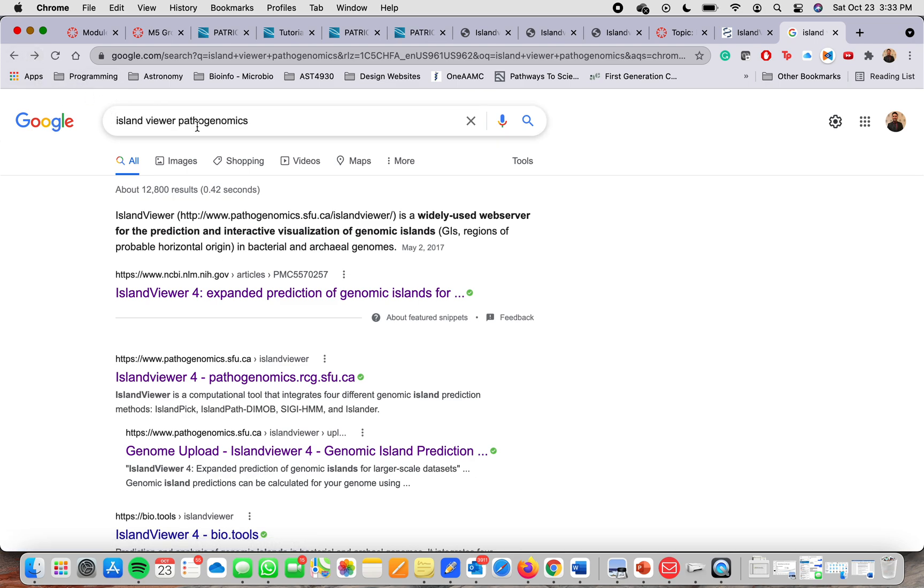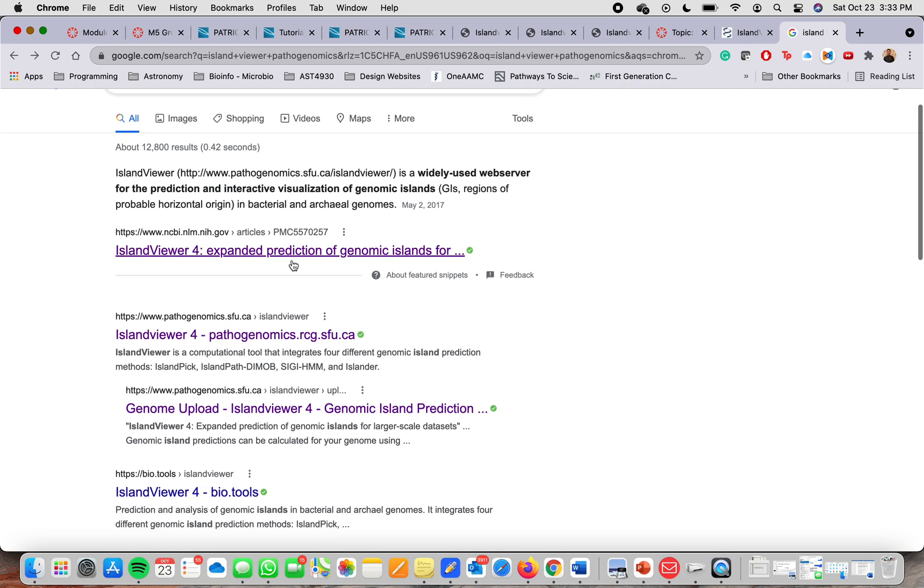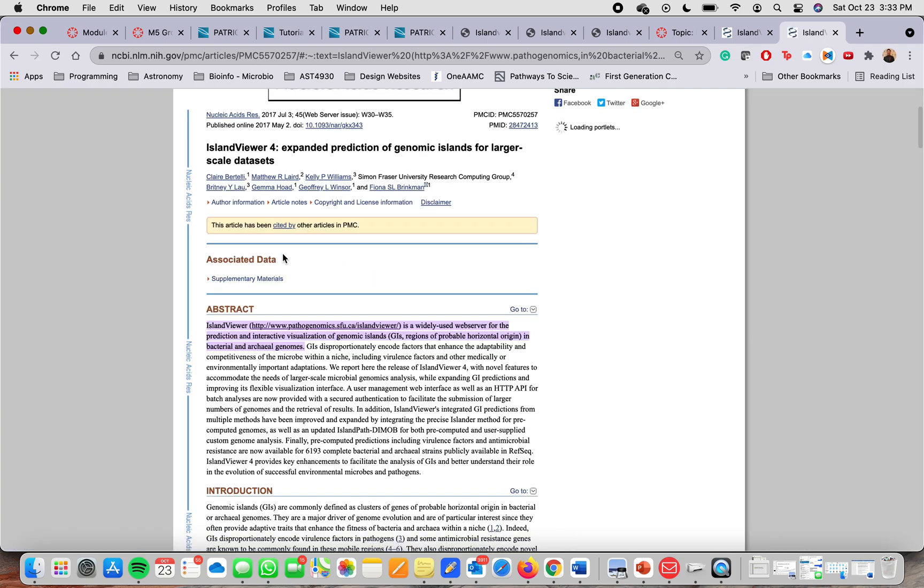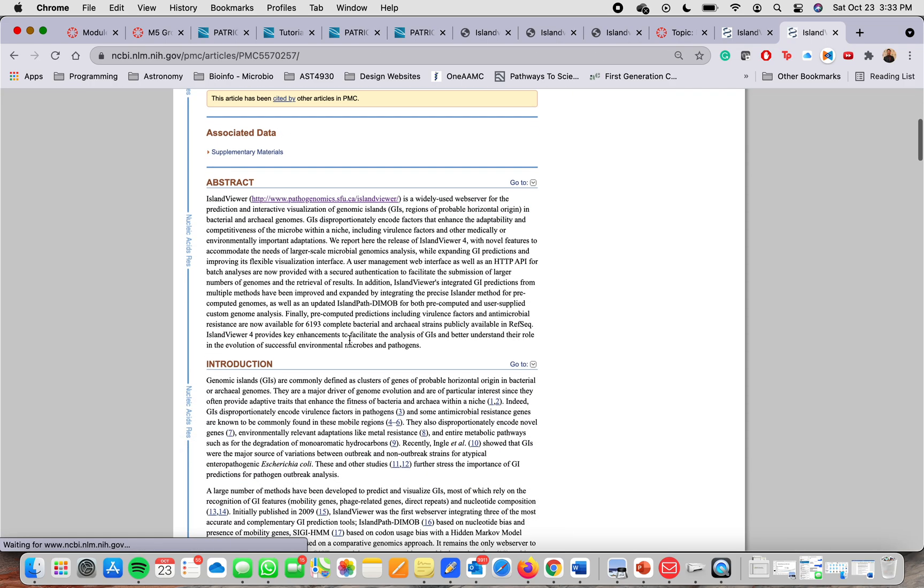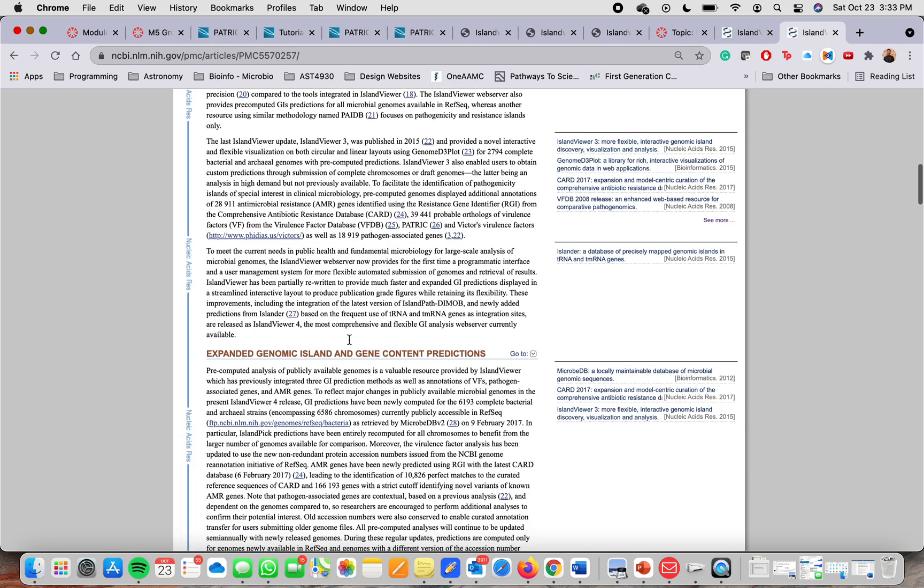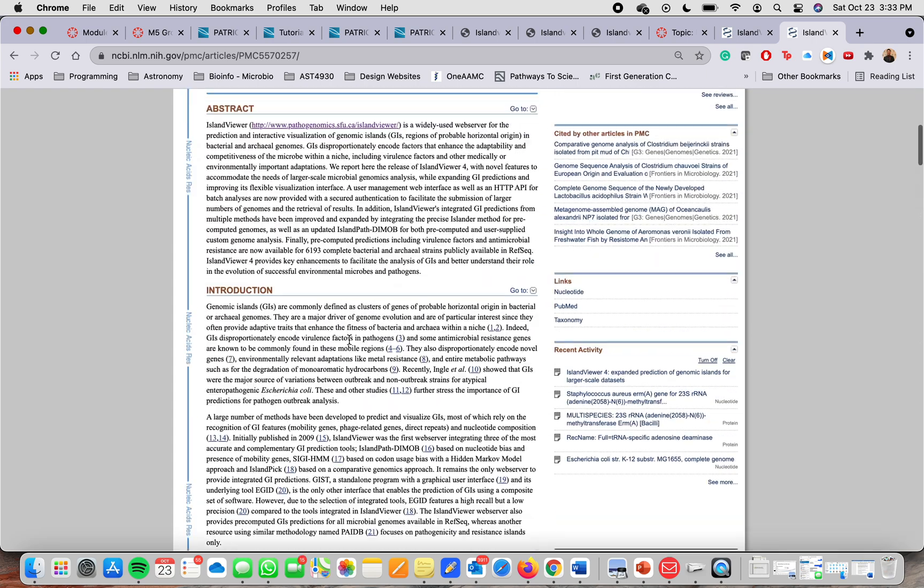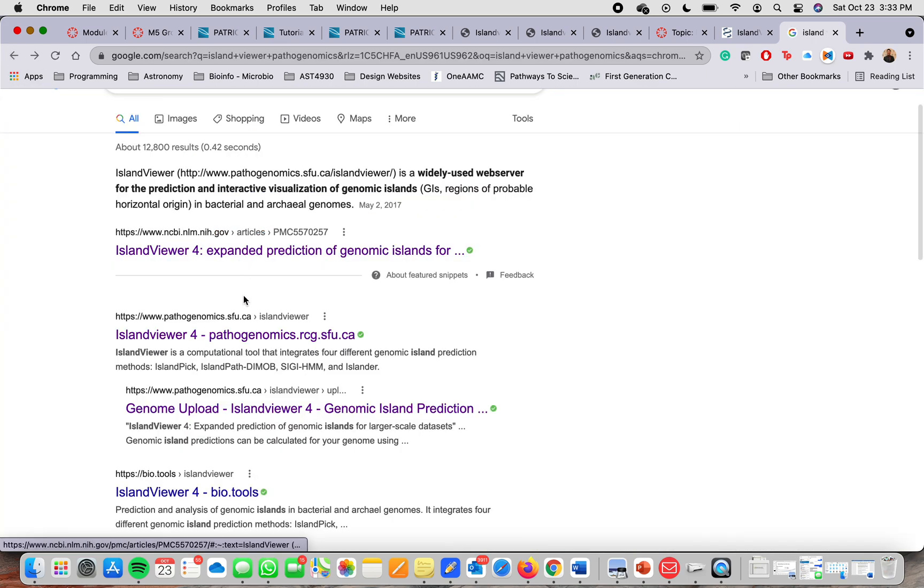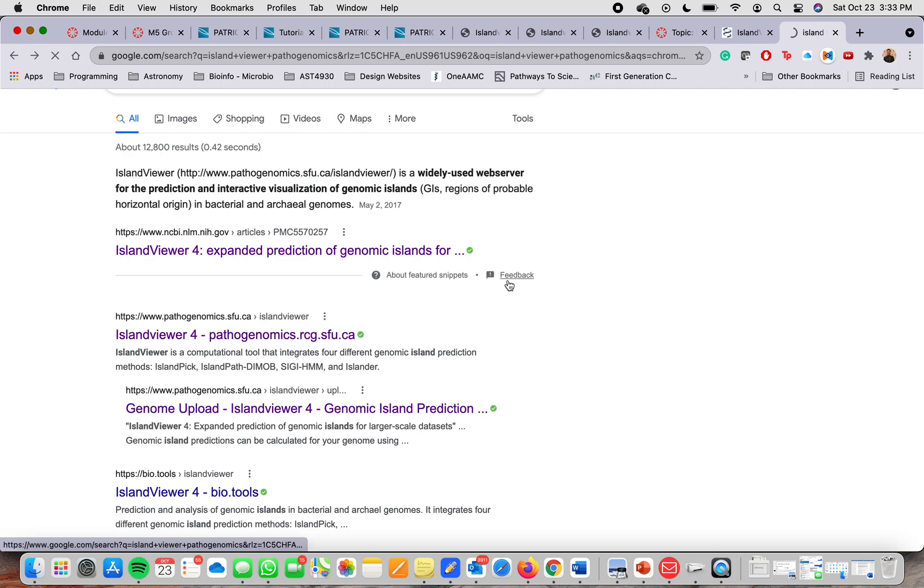Island Viewer Pathogenomics, and besides providing me a paper on the NCBI website about it, it also provided me with a link to the main website.